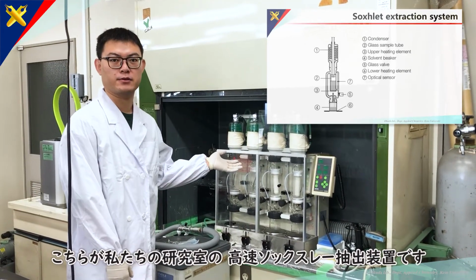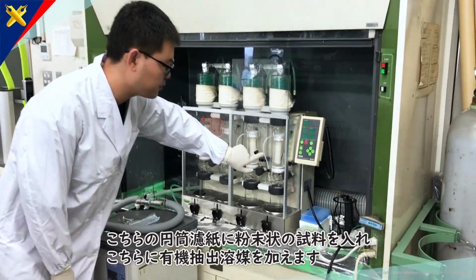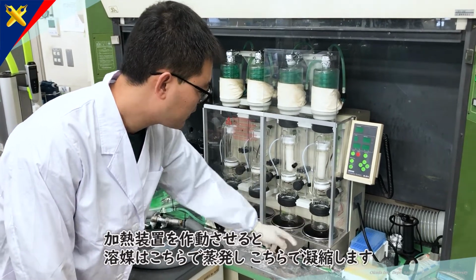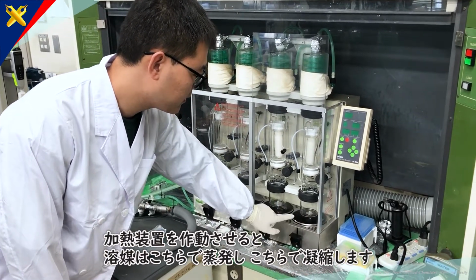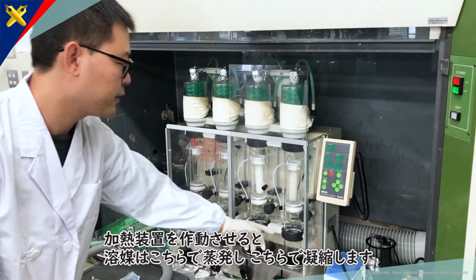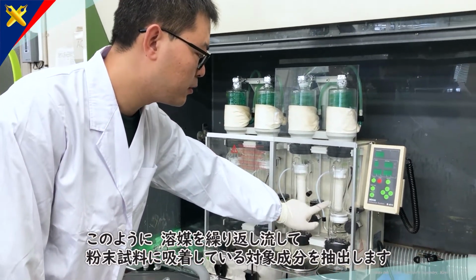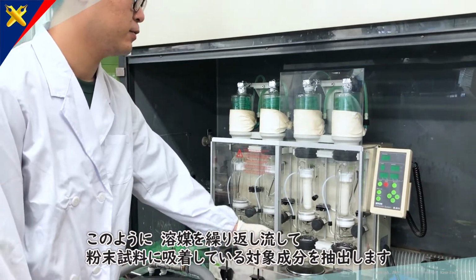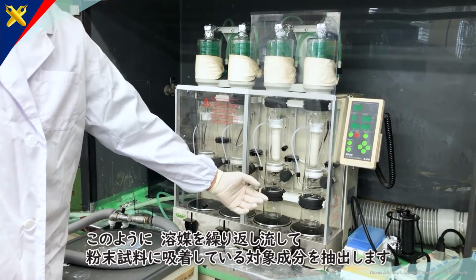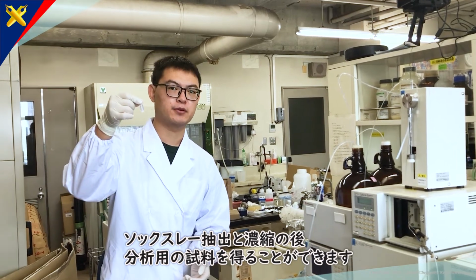Here is our lab Soxhlet extracting system. We put the powder from the filter into this sample filter and add the organic extraction solvent here, and turn on the heating element, so the solvent will evaporate and go here to the condenser, flushing the sample once and once again, to extract the pollutants that are absorbed in the powder. After the Soxhlet extraction and the concentrating, we will get the samples for analysis.